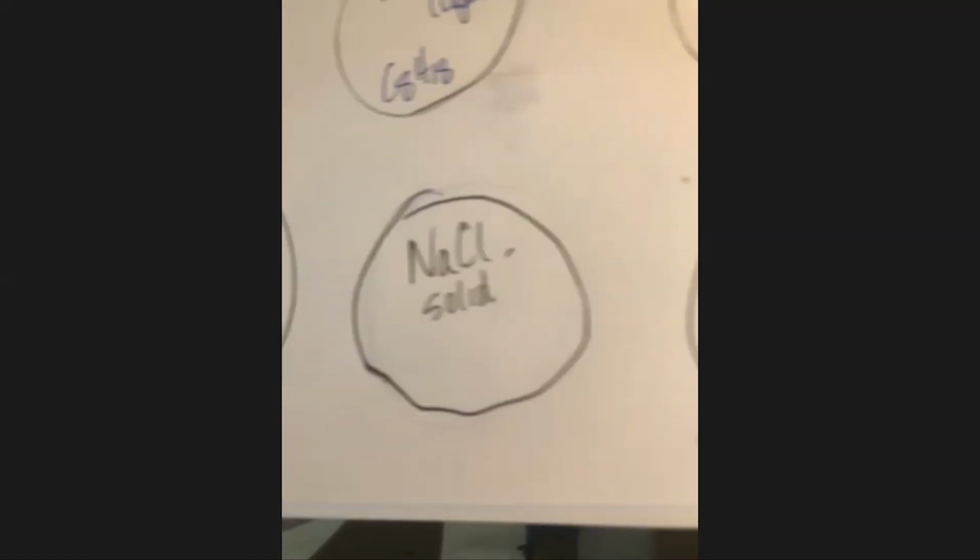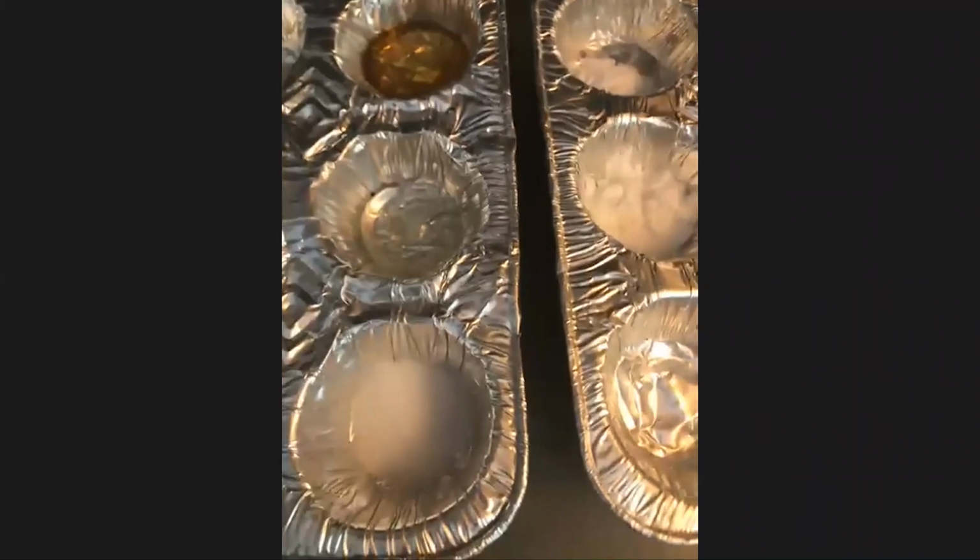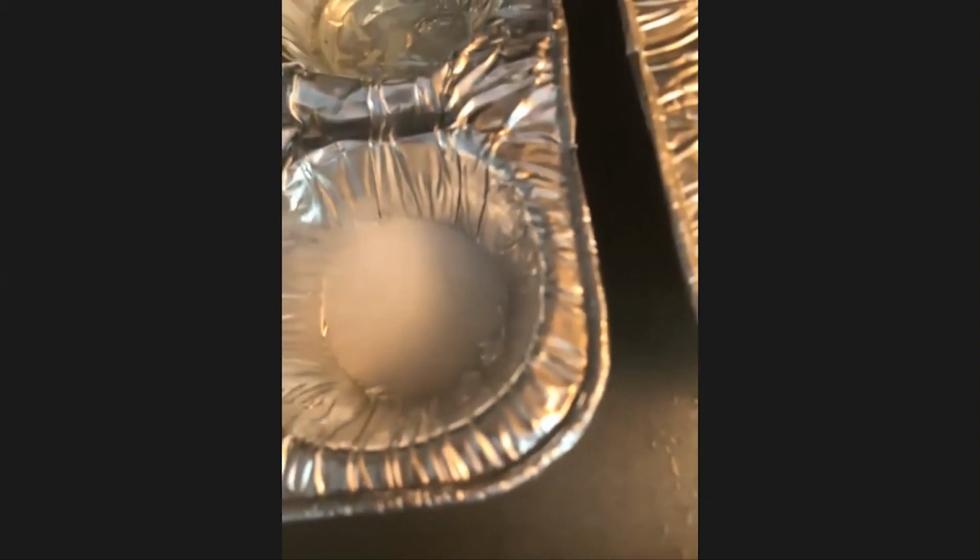Right. So that tells us that there must be some other type of intermolecular force at play with the sodium chloride, right? There's obviously some sort of strong forces. I mean, we can see the gasoline boiling like crazy. We've seen the water melt, and nothing is happening in the sodium chloride. So it obviously has some sort of really strong intermolecular force holding it together.